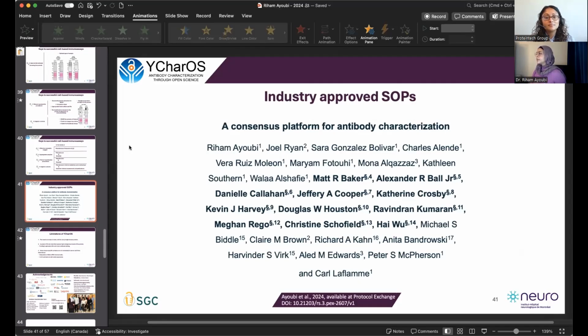We worked on cytoplasmic, cytosolic proteins, nuclear proteins, lysosomal, and even inflammasome-specific proteins, which is NLRP3 that I have in mind. It's been successful at extracting proteins from, we even worked on mitochondrial proteins as well. So yeah, this broad selection of proteins and the success of these commercial buffers in extracting them, I think gives a solid confidence about the efficiency of these buffers and this protocol.